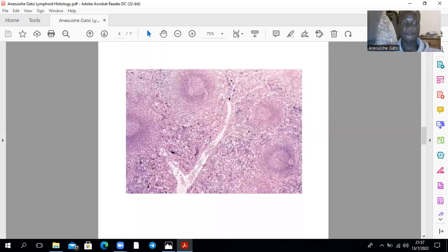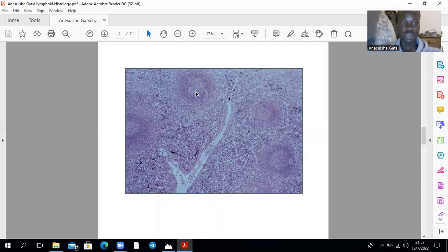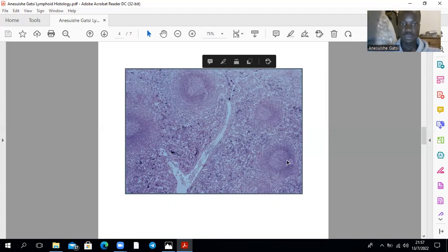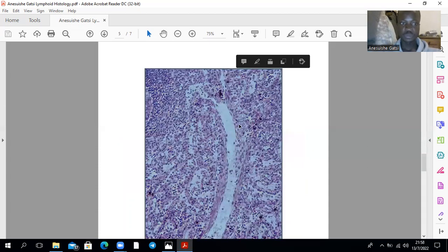This right here is splenic tissue. That's a lymphoid nodule, that's a lymphoid nodule right there, that's another lymphoid nodule, and that's a germinal center. Right over there, that's a central arteriole.